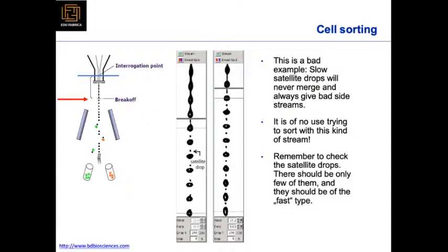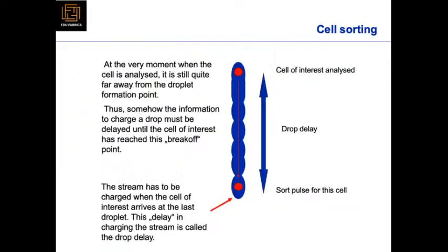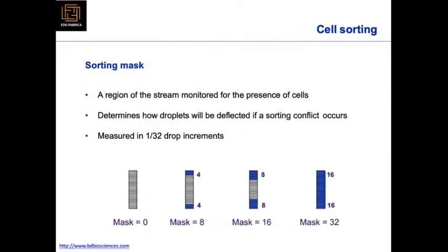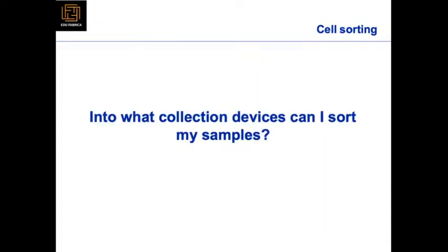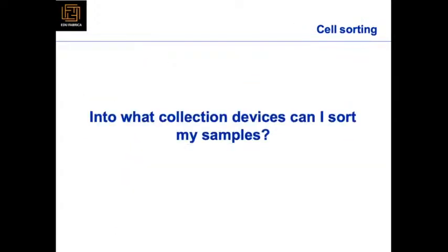So they're just telling how, with different methods, you can take care of the droplets. Sometimes it has long droplets, which is not good. It's better to have small droplets so that the results could be better. So that's all about it. I will not go into details, it's not required for us. Because we are learning the basic principle, it will not make sense to go into details so far with this.